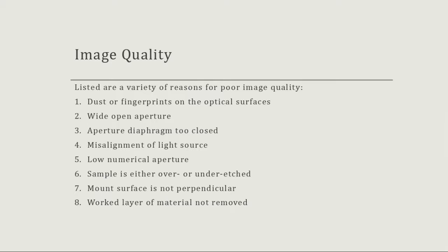Okay, once it is prepared, especially in the etched condition, the moment you put a fingerprint on it, you have ruined the evidence, because the only way that fingerprint can be removed is by going back to repolish, not completely through the entire process, but to repolish and then etch again. And now you're risking, especially if it was a good sample, bleed out, scratching. What else can you risk? Planing your sample. So the sample after it's prepared is very delicate.